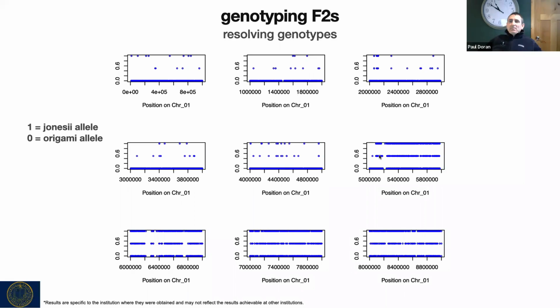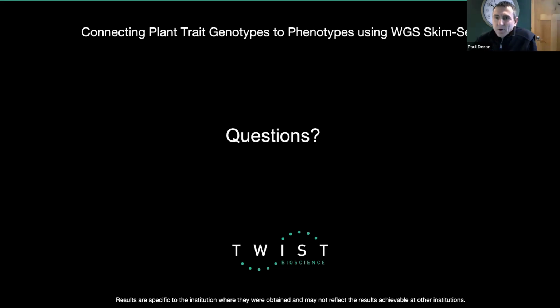Okay, thank you. So there was a second part to that question. Would you do a binning technique to look at genetic diversity that arose through mitotic division over generations? And if not, what would you recommend? A binning technique to look at genetic diversity via mitotic divisions over time within an organism.